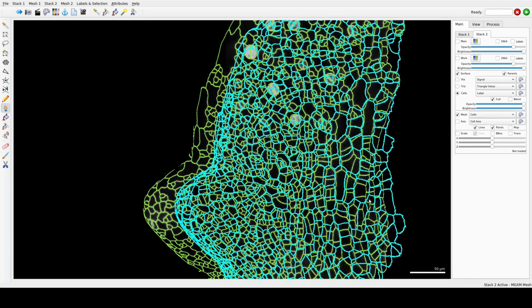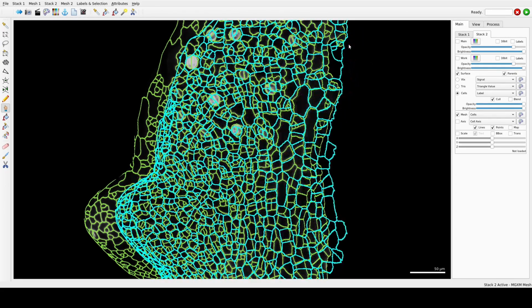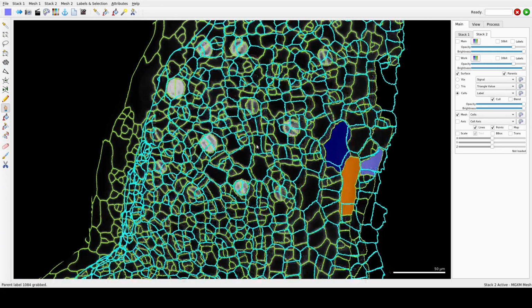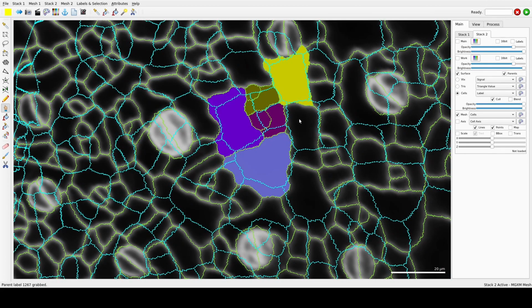Okay. So you can try something like these ones, you see. You see sometimes there's cell division. There we go.